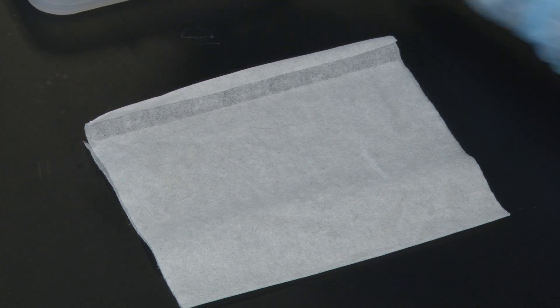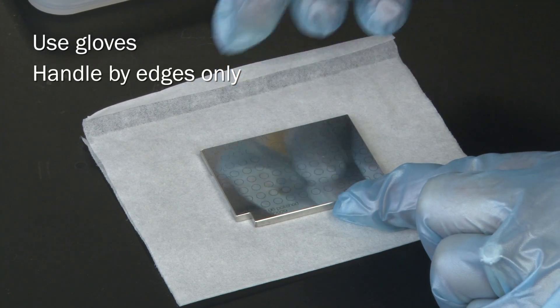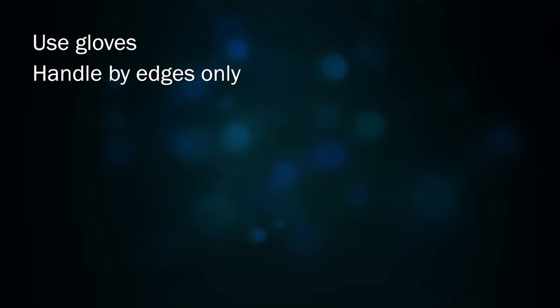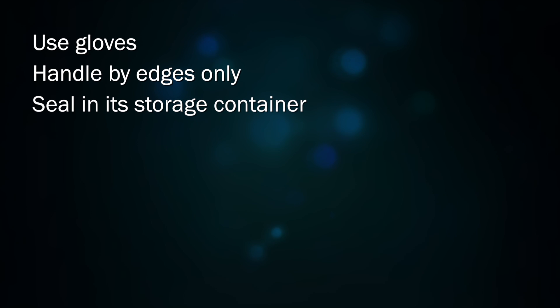From this point forward, only handle the target plate on its edges with your gloved fingers. To avoid contamination by dust, keep the plate sealed in its storage container until it's ready for use. Lab coats are a consistent source of dust and other microscopic debris. Your street clothes are often more clean than a lab coat.